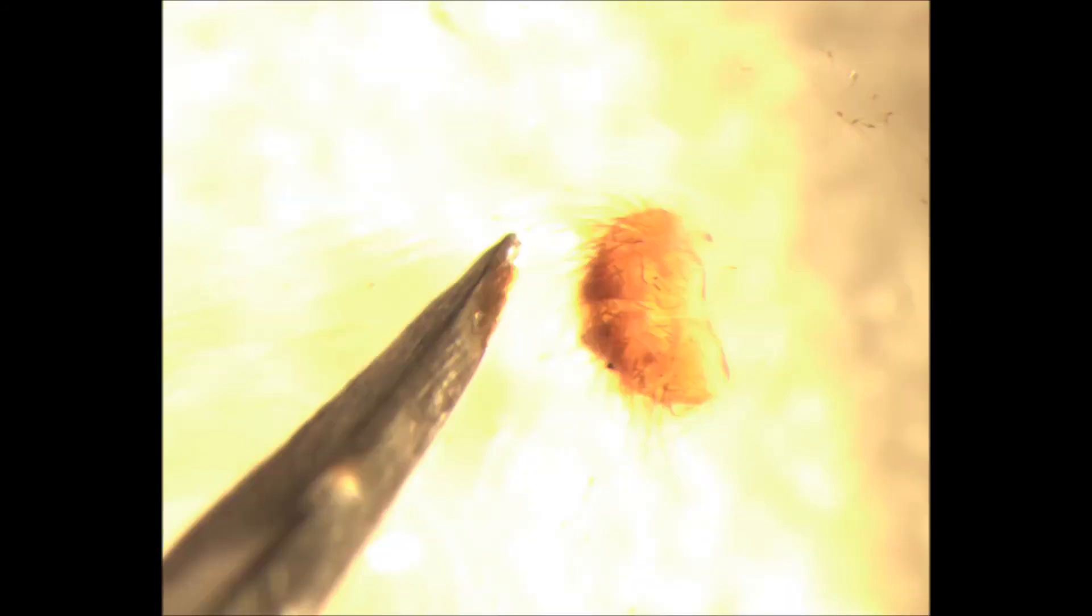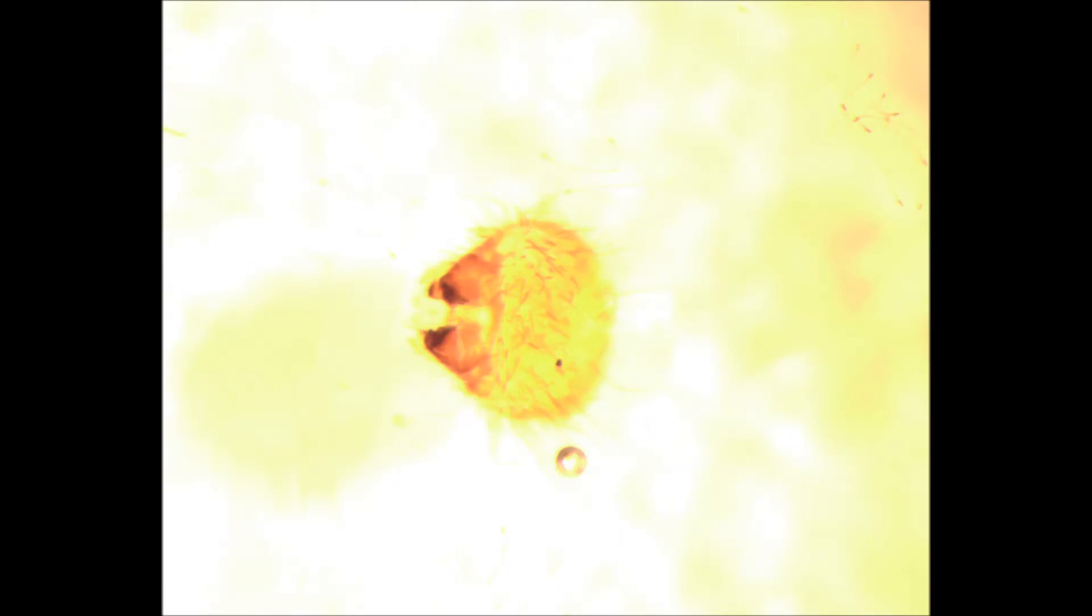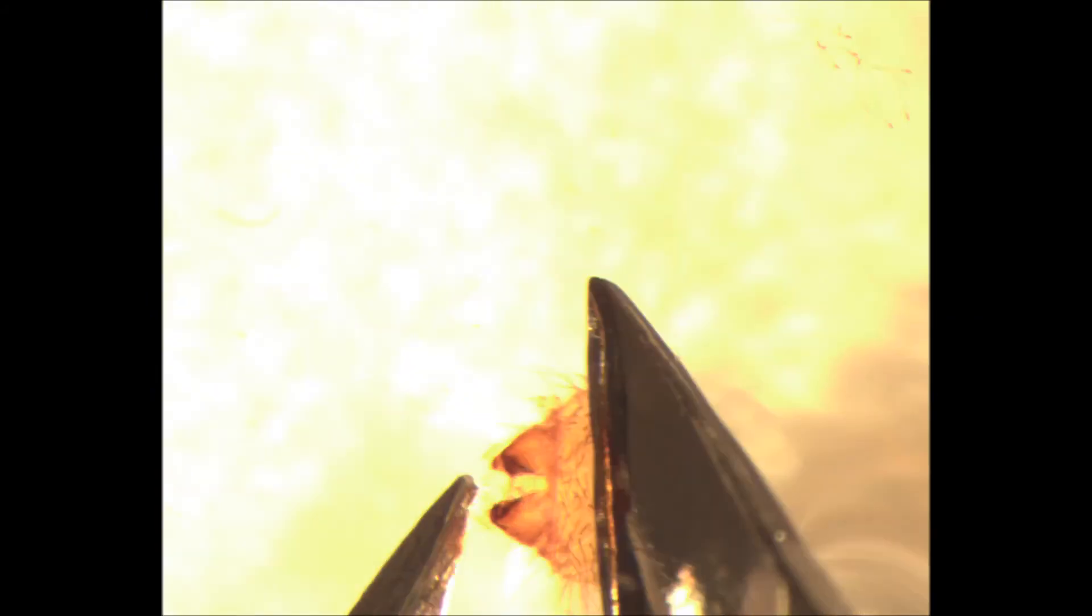I'll separate the two parts. There's the head. I'm cutting it down and trying to cut away the back half of the head capsule, which I won't use much taxonomically. I'm going to zoom in on the front part of the head we have left.